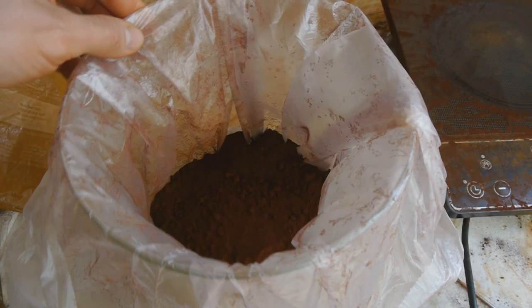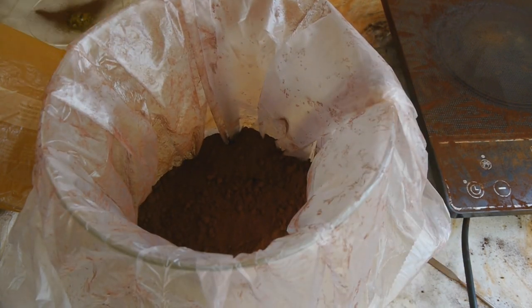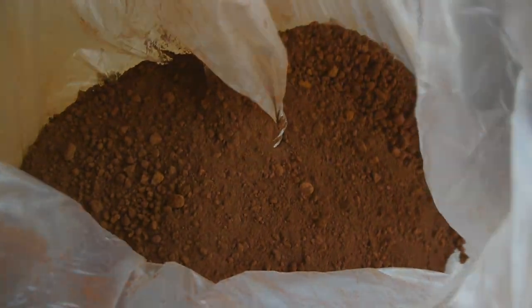I've measured the yield now and filled everything into this bag and it turns out to be about 2.16 kilograms, which is quite a lot. It's probably around 90% yield, I would guess. So here you can see what the total yield looks like. It's this beautiful red powder.